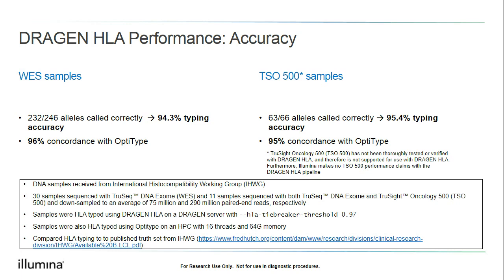What we also did was, in addition to comparing against the known truth for these samples coming from this group, we also ran concordance against another popular HLA typing tool called OptiType.